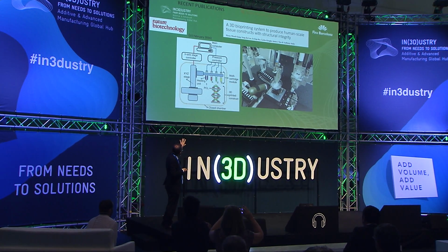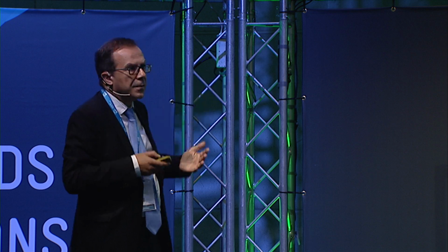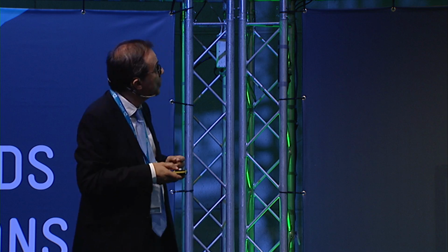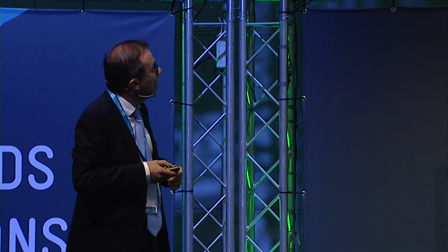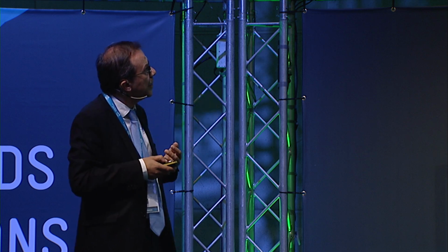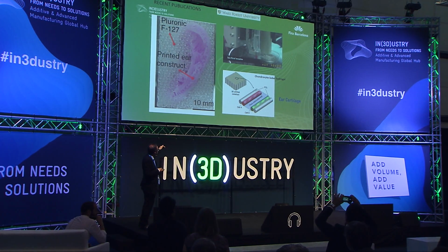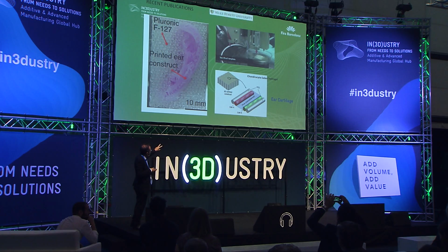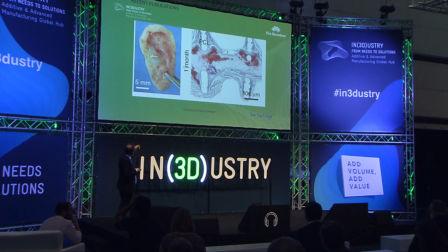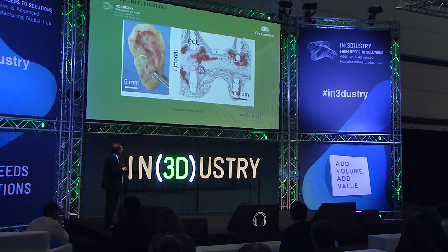using, in this case, 3D bioprinting with multi-cartridge models in order to combine all of these materials in a 3D construct, combining structural materials with sacrificial materials. And using this approach, it will be possible to produce, for instance, a printed ear construct, in this case using chondrocytes in this process, and it is possible to observe the option to produce microchannels for porosity, to introduce different types of cells, and also introduce a structural material in order to help in the construction of the system. And finally, we obtain a chondrocyte-laden hydrogel with the possibility to mimic the ear cartilage.